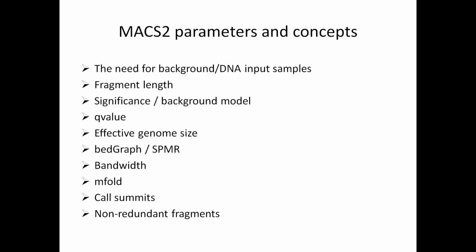Now, when paired-end fragments are used, it is required that either the 5' or 3' end of that fragment be different. Now you can also set MACS2 to allow some redundancy that can be automatically determined according to the effective genome size and the number of reads, or you can set the level of redundancy yourself.